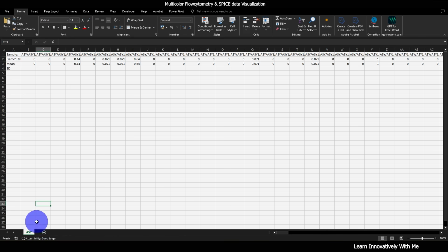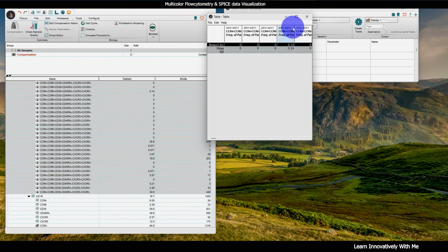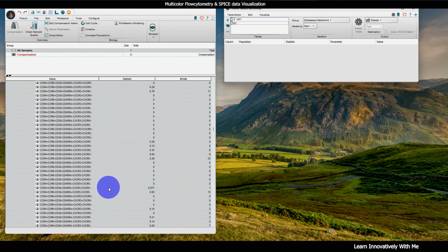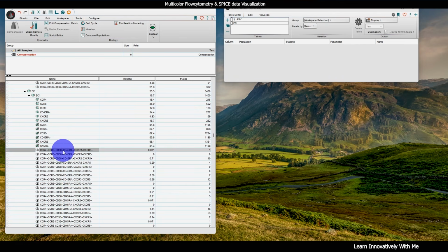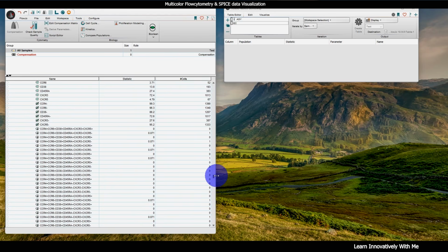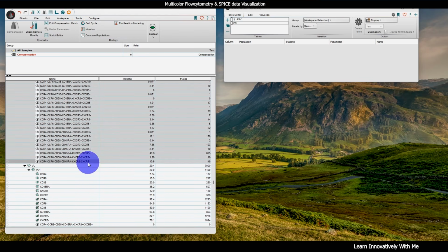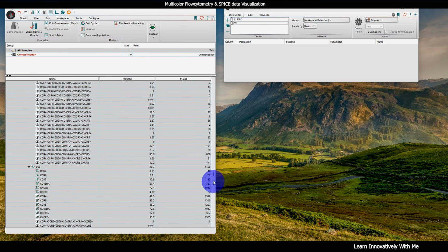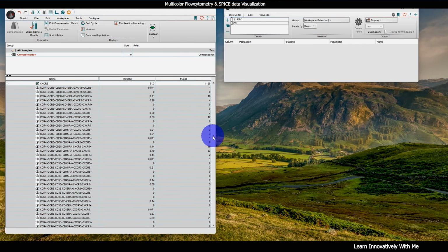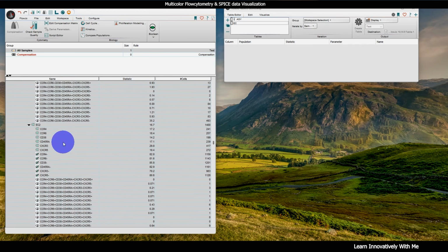I will make a tab for the next, EC and VL. I'm going to make a new table for EC here. Again, I'm going to select the combination data of the EC individual. Now I'm going to deselect the other things that are not in the combination way.